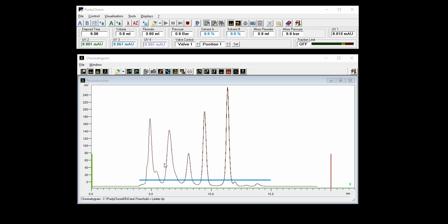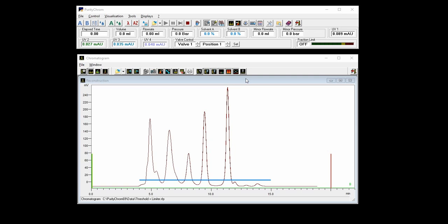However, if you have a peak like this where a shoulder is above this threshold, the software cannot discriminate here. So this will be collected as one peak. You can either set a threshold higher or you can use the peak sampling, which I will explain later on in this video, or you can also use a limiter in combination with a threshold.